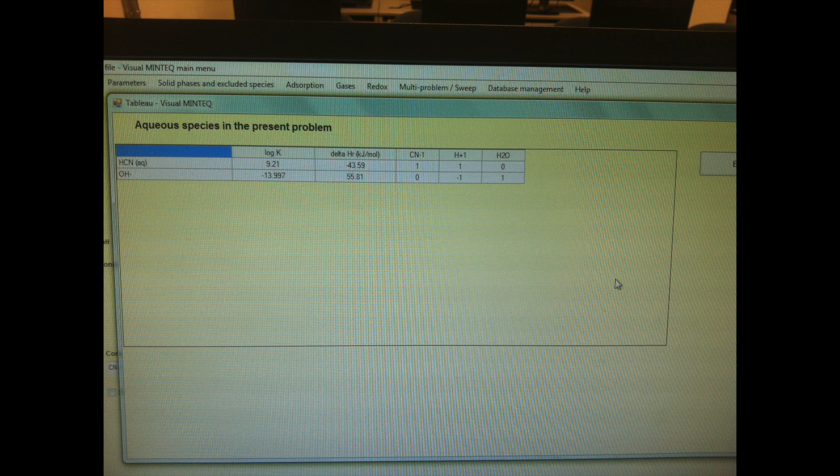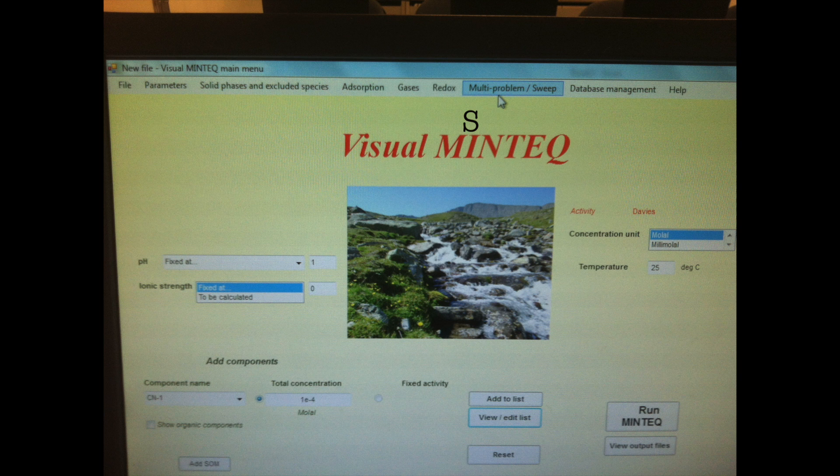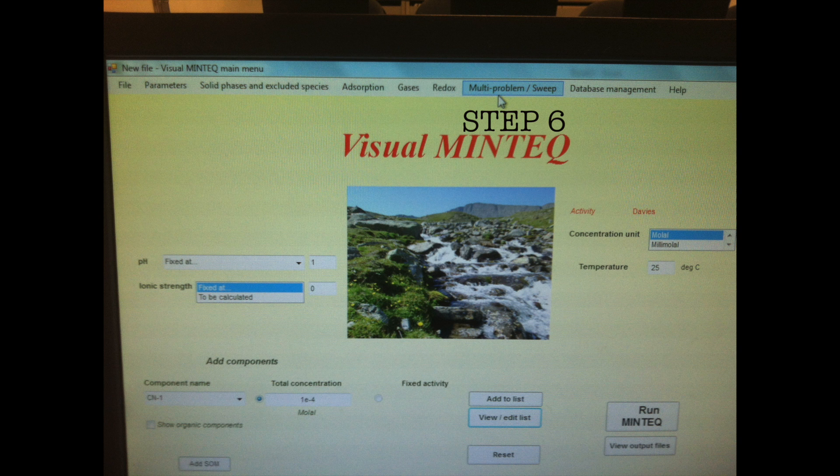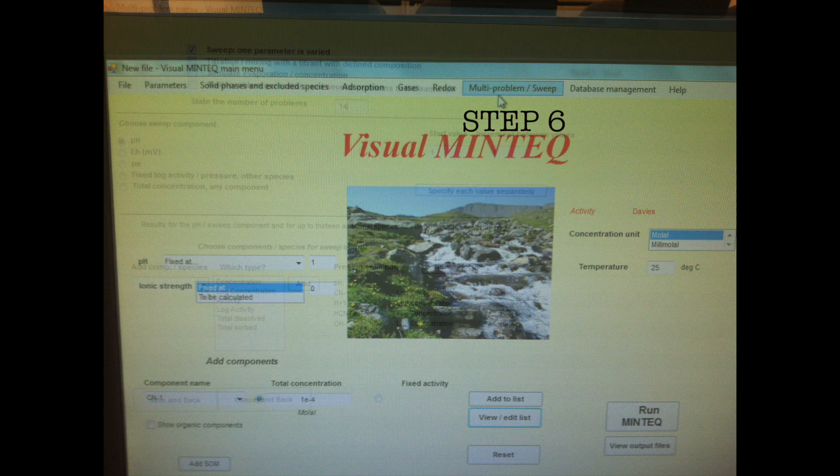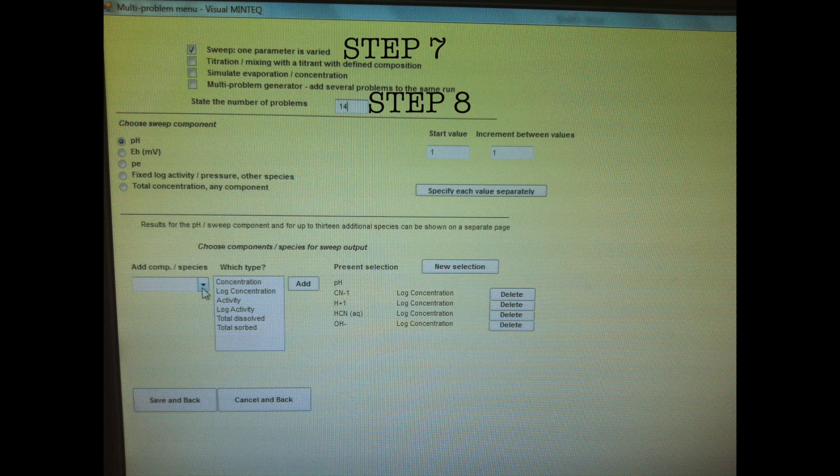Now let's go back to our main menu and do a multi-problem sweep, so click on that menu item. What we're going to do now is sweep a parameter and repeat the problem 14 times, and the parameter that we're going to be changing is pH. Let's start at a value of 1 and incremental values of 1 from there.